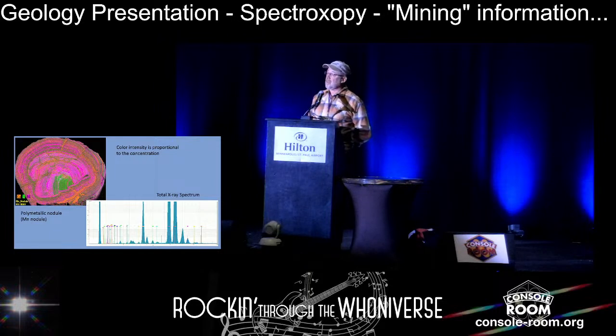And then we assign a color. The colors obviously are not real. We try to come up with some aesthetic combinations. Here we choose to display calcium, titanium, and nickel. What's interesting in this particular specimen, the nodule is probably a couple inches across. A friend of mine brought it in, we cut it and polished it, and he let me keep half of it.